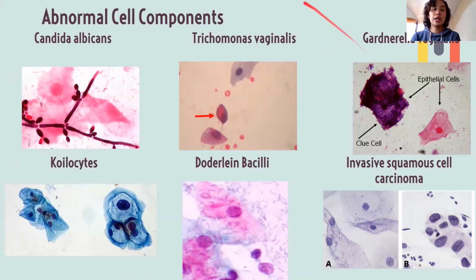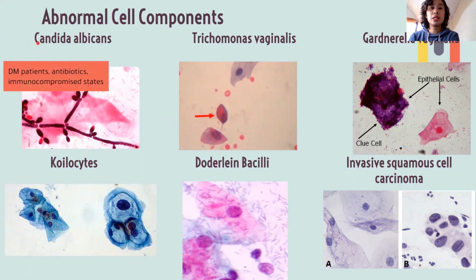So, tapos na guys. So, ito ang Candida albicans. Yan, di ba? Nakapakita na ako kanina. So, common to sa mga women who are diabetic, who are immunocompromised, o kaya yung mga nagtitake na antibiotic, namamatay na yung mga normal flora, ang nagtatribe na yung mga fungi. So, Trichomonas vaginalis, so pear-shaped, this STD that is from a parasite. So, ang consequence nito, you have a strawberry cervix.